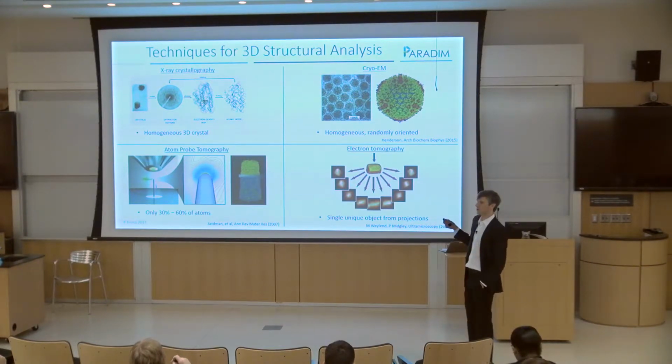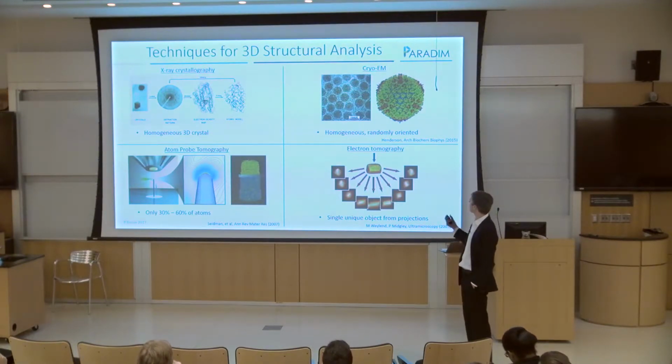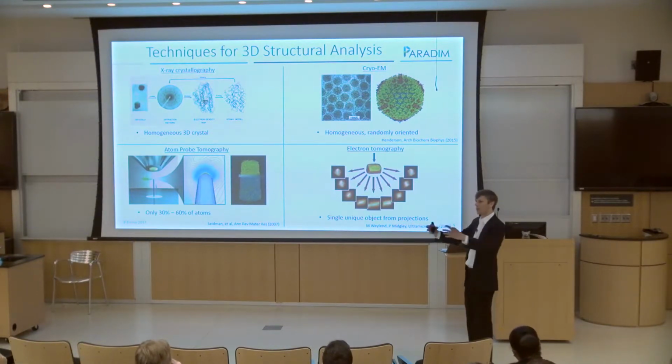Cryo-EM has been going on for a really long time, and I told you a little bit about that, where they take exactly the same objects. These are viruses. They purify them, they take images of them, and you can get a three-dimensional reconstruction by averaging thousands to tens of thousands to hundreds of thousands of images of these. It's called single particle reconstruction, but that means taking many particles and making them one single particle.